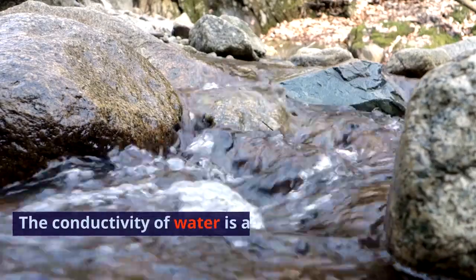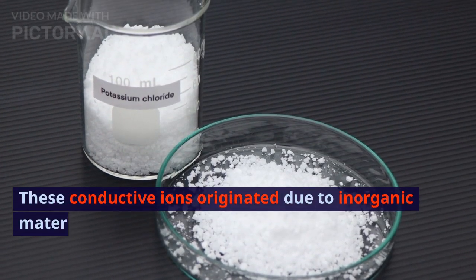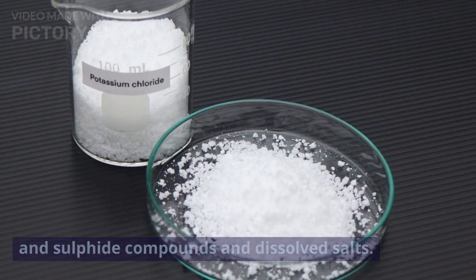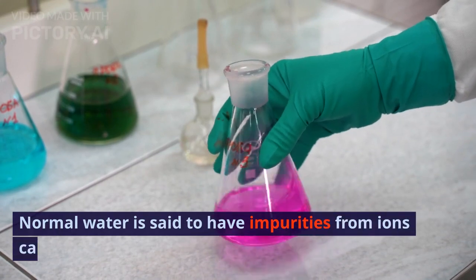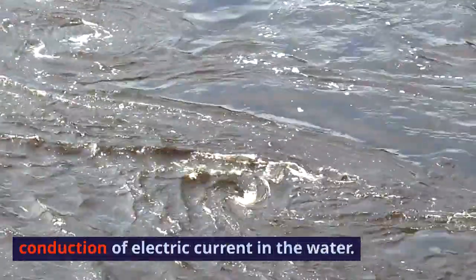The conductivity of water is a measure of the capability of water to pass electrical flow. This ability directly depends on the concentration of conductive ions in the water. These conductive ions originate from inorganic materials such as chlorides, alkalis, carbonate and sulfide compounds, and dissolved salts. Pure water is said to be a bad conductor of electricity. Normal water has impurities from ions called minerals, etc. These ions are responsible for the conduction of electric current in the water.